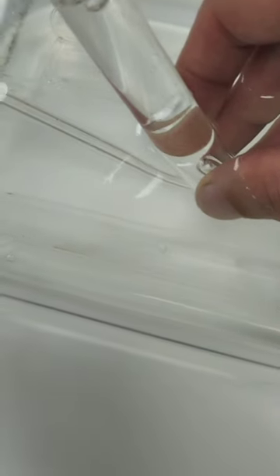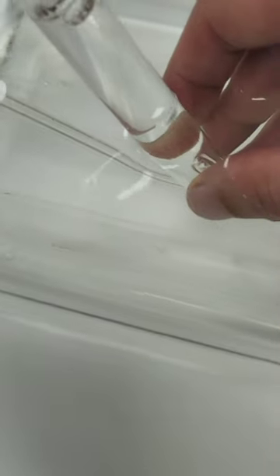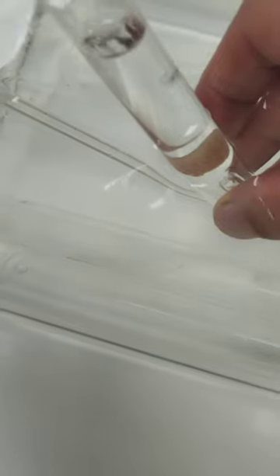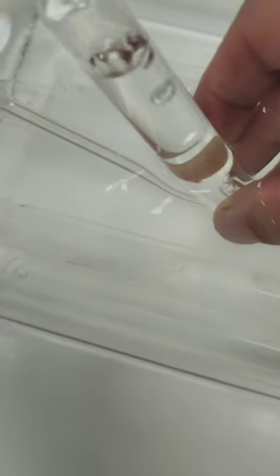Here you can see I'm using downward displacement of water to collect the ethene, which is gaseous, into a test tube. I'm going to seal this test tube off and use some bromine water to test for the presence of that ethene.